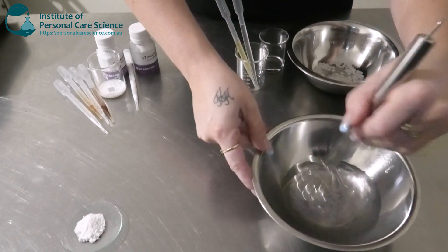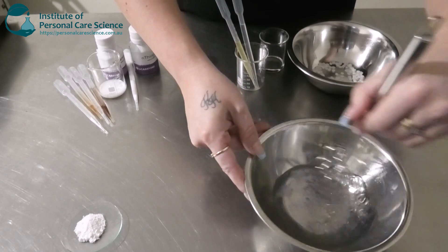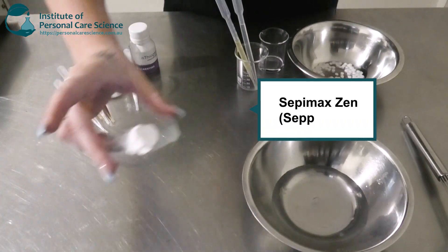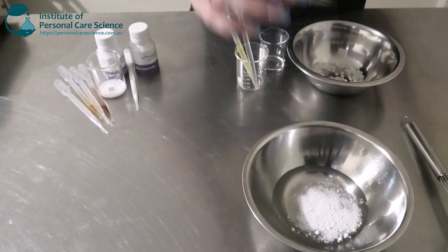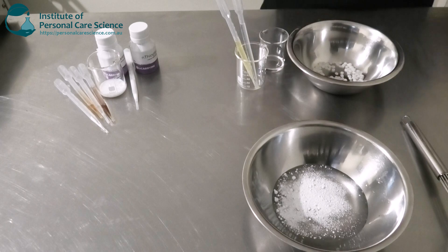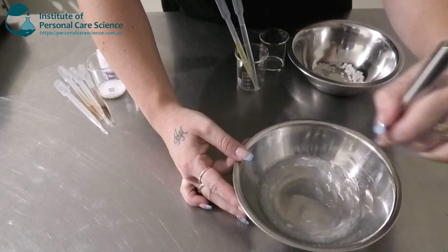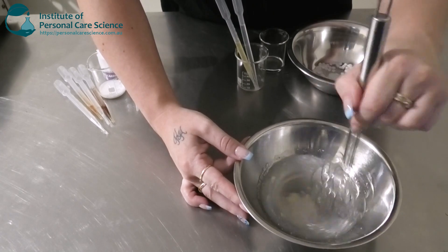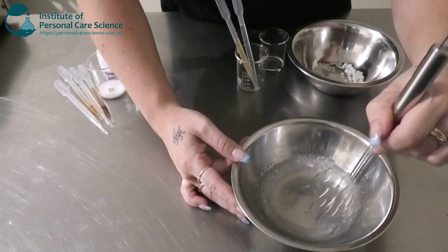I'm just going to give that one a little bit of a stir. And now I'm going to add my SepiMax Zen. Now this will not hydrate straight away — it will take some time. So if you have an overhead stirrer, you can use that to leave it on constantly stirring. Or you can give it a stir to wet the polymer and just disperse it, then cover and leave it to hydrate and come back to it.